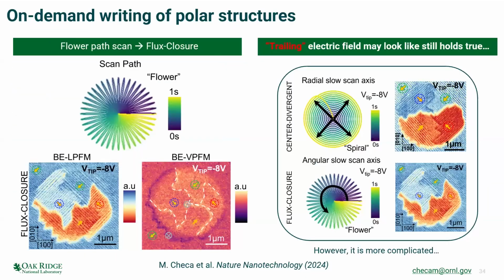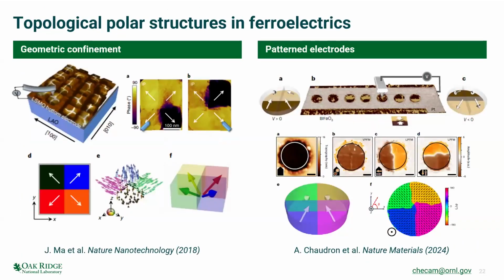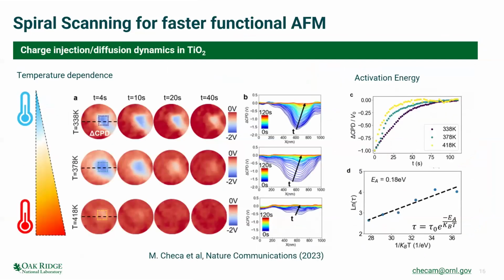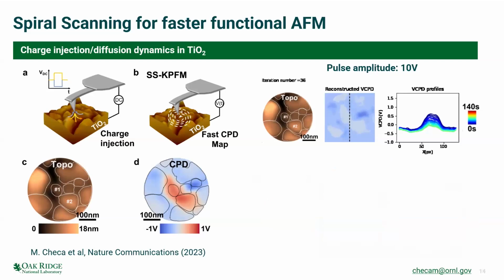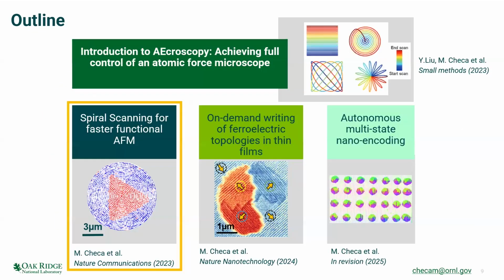It's a little tricky because, as I said, it's a trade-off between the spatial resolution and the temporal resolution. So when you want to use the spiral scan to actually read faster, this will take forever, but oh my God, it's too much.